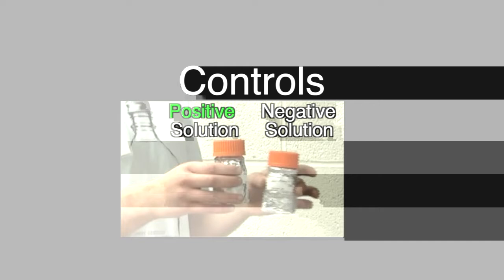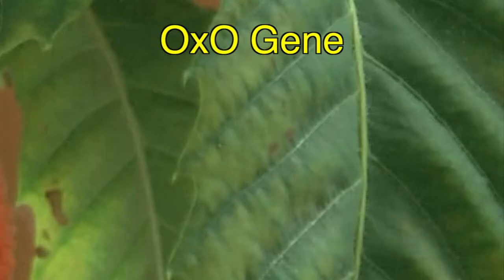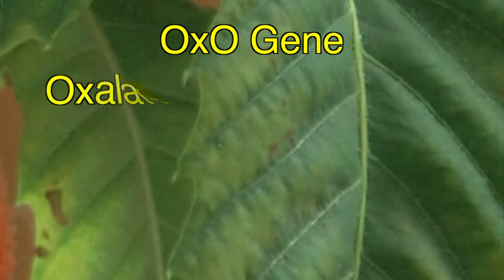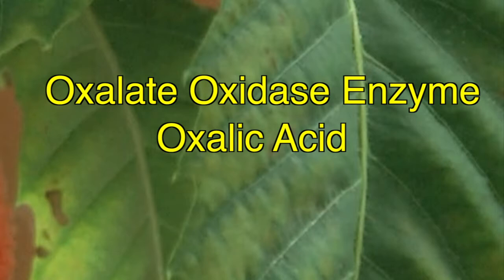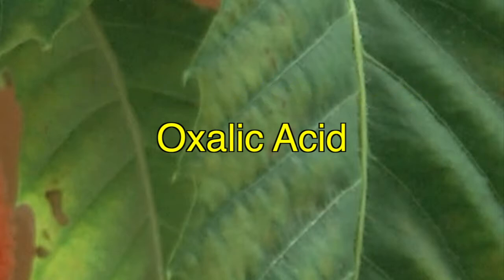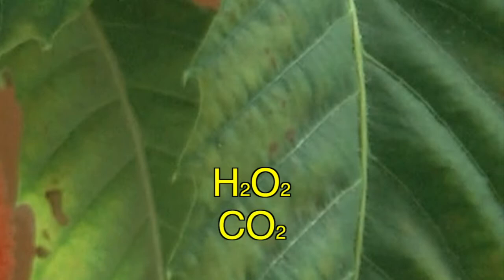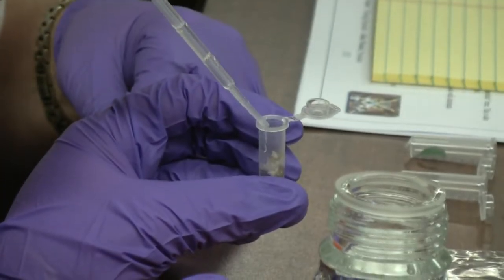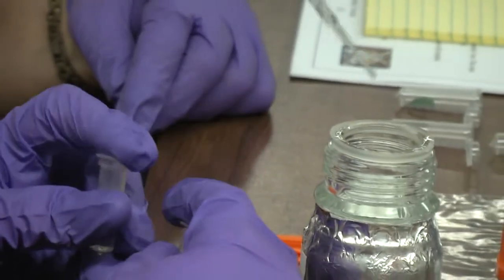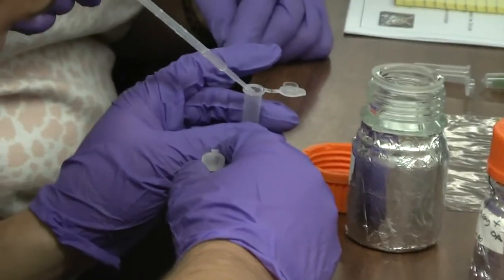The theory behind this is that there are a negative control and a positive control, and if our tree has oxalate oxidase, the gene, that codes for oxalate oxidase, the enzyme, and that is what breaks down the toxic agent of the fungus, which is oxalic acid. And the oxalate oxidase breaks down oxalic acid into hydrogen peroxide and CO2. And both of those are beneficial for plants when they're wounded because the hydrogen peroxide helps with cell wall lignification, so it basically walls off the cell and protects it from the acid stronger than if it were just a regular cell. And then the CO2 is just a natural byproduct of the plant anyway, so it's not a big deal.